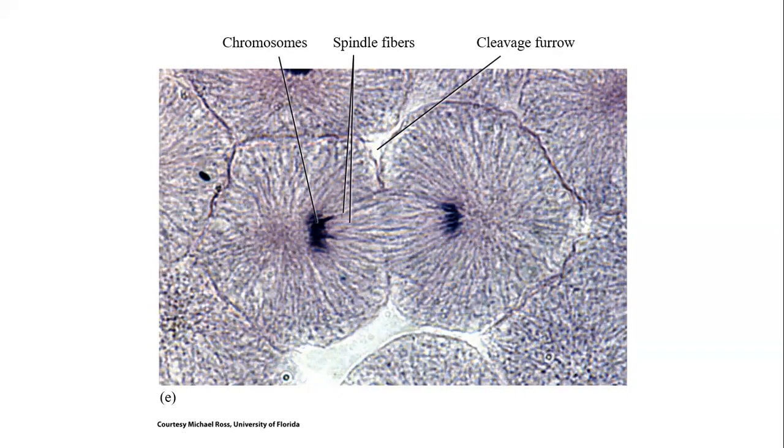And before I switch away from these microscope slides, it's important to mention just what exactly you will see under the microscope when you take a look at these on September 11 on Saturday. The cells that you see here are whitefish cells, and this entire set of hundreds of cells represents a fish embryo.